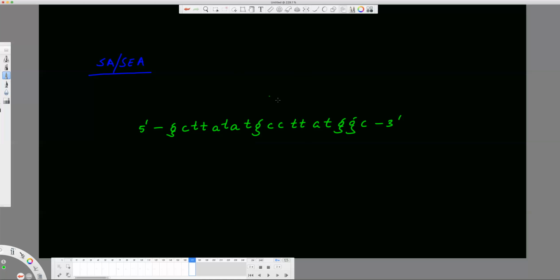For example, if I draw it in inverse direction and I see some homology, I'm just looking at one orientation. Okay. So C, G, G. I'm now typing this sequence from this end to the other end, inverse direction. So this becomes T here, A, T, T again, right?